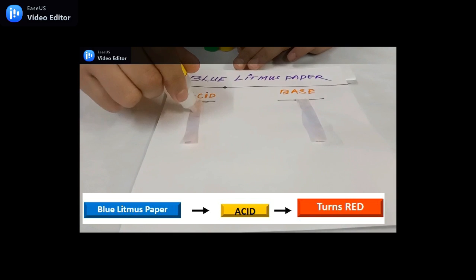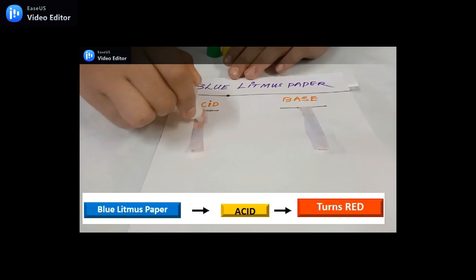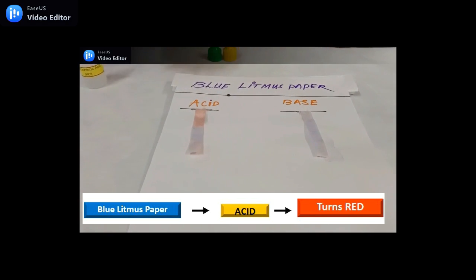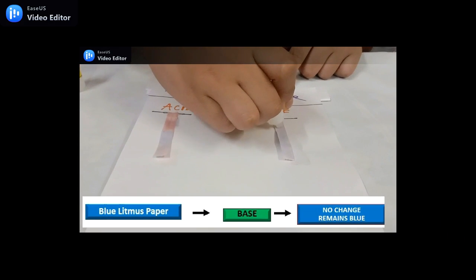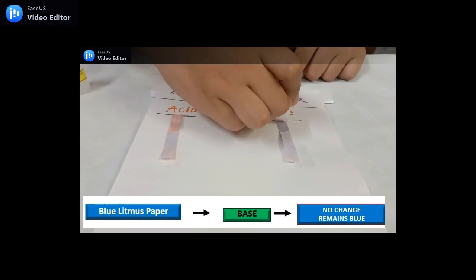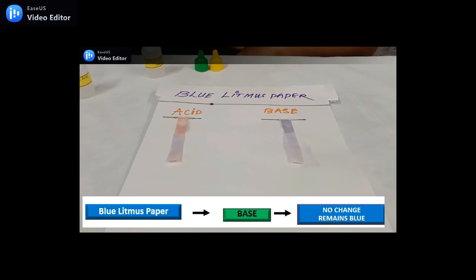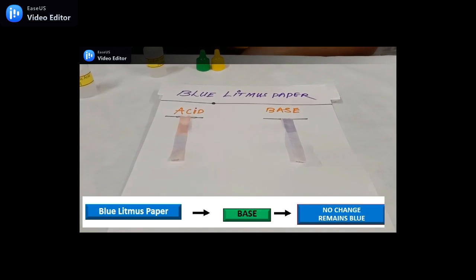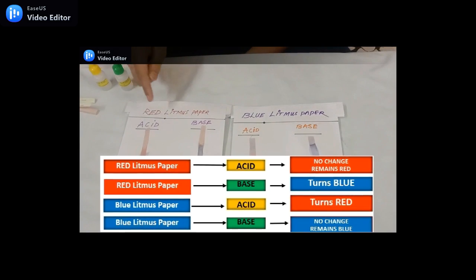Let's put acid on blue litmus paper — it changes its color to red. Now let's put base on blue litmus paper — it remains blue. BBB: to remember easily, BBB means base on blue litmus paper remains blue.